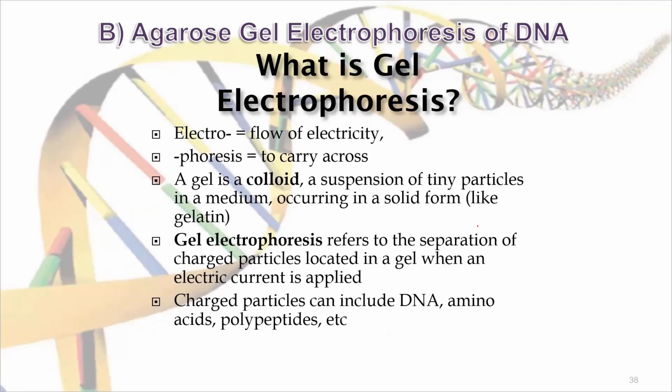Let us say you have taken a DNA molecule initially, and suppose you have cut it down with the enzyme into multiple pieces. Let's say you have cut it down into 1, 2, 3, 4, 5 pieces, for example. And now your requirement is, out of all these various pieces of DNA, you are looking for only this particular piece.